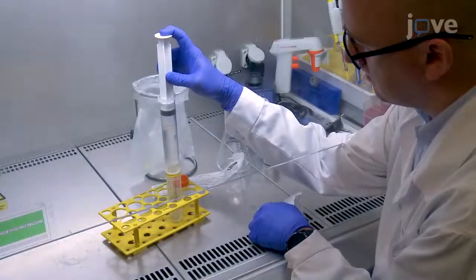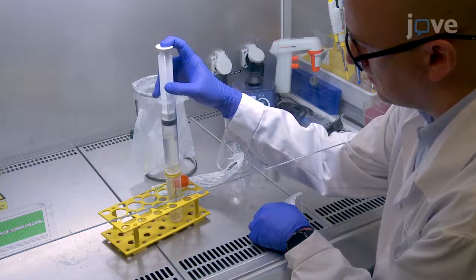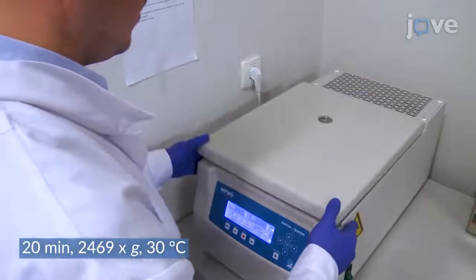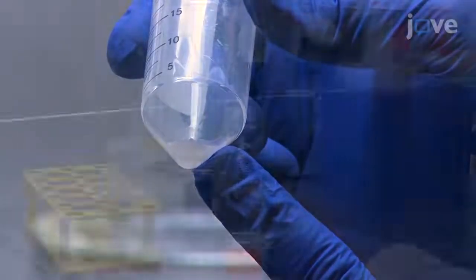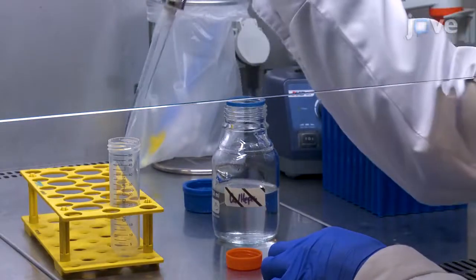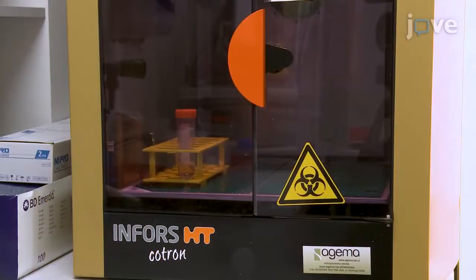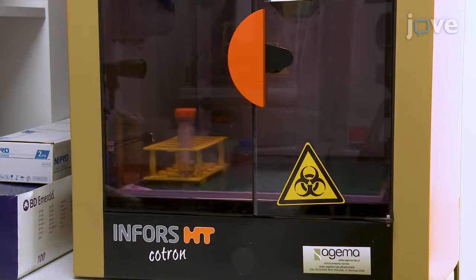Strain the B. bacteriovorus culture through a 0.45 micrometer pore size filter into a 50 ml conical tube and spin down the filtrate in a centrifuge. Then re-suspend the B. bacteriovorus pellet in 3 ml of calcium HEPES buffer to a final optical density at 600 nm of approximately 0.2, and incubate the bacteria at 30 degrees Celsius and 200 revolutions per minute for 30 minutes.